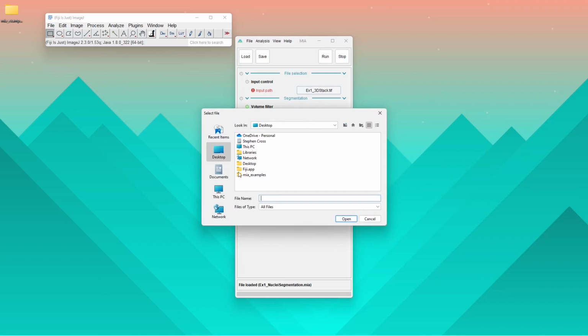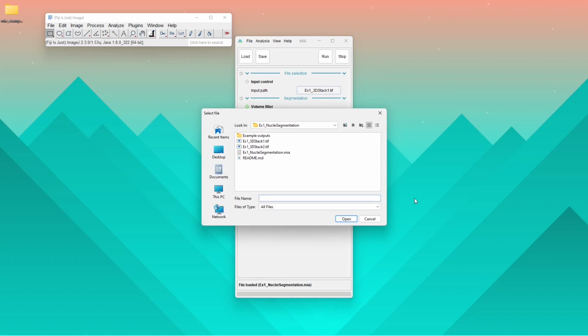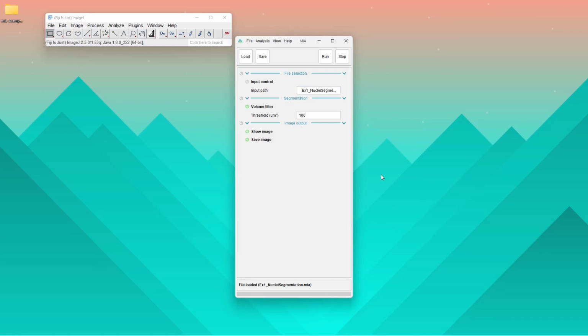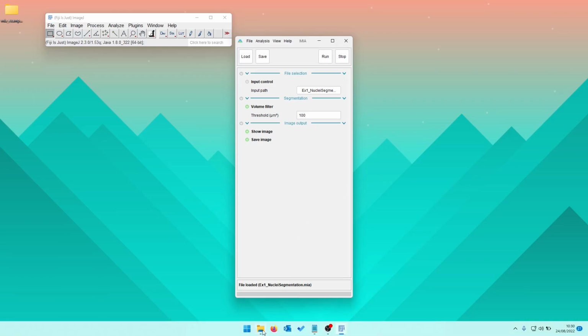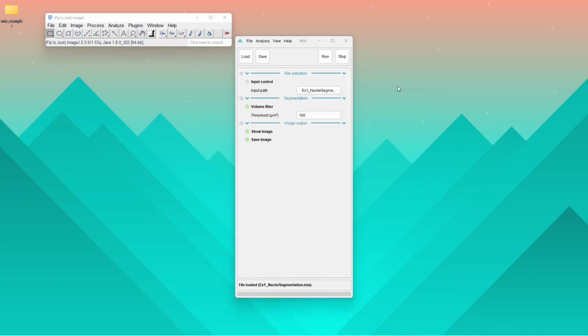So we just click on this button, I go to desktop, load in the file. And at this point, I can either select an individual image, so select that one stack, or you can also just put yourself by default into batch mode by just selecting a folder. And when we're in this batch mode, it's going to identify any images within those folders which match up to certain criteria set within the workflow. So in this case, the parameters, which are again edited via Editing View, it has to be a .tiff, and it can't have a name containing underscore overlay, because we know that's going to be our output, and it prevents us accidentally reprocessing the output images.